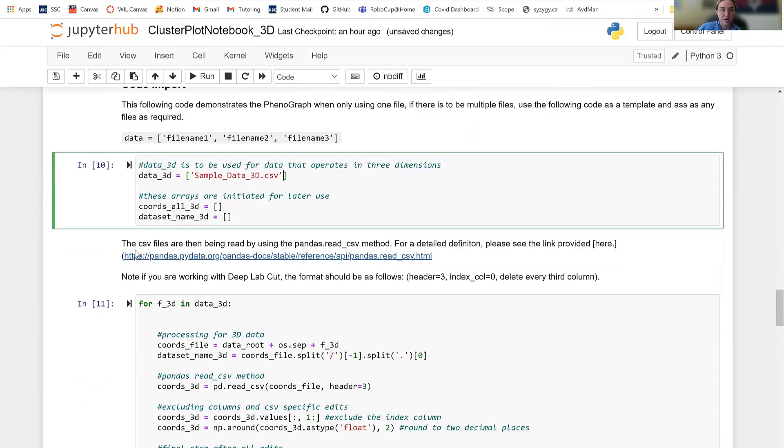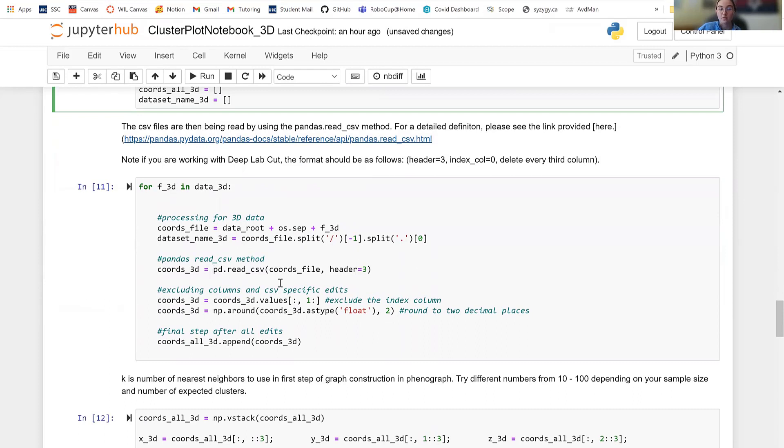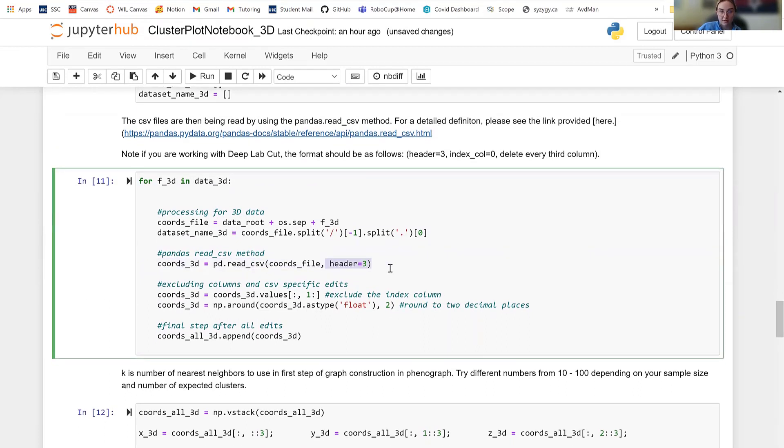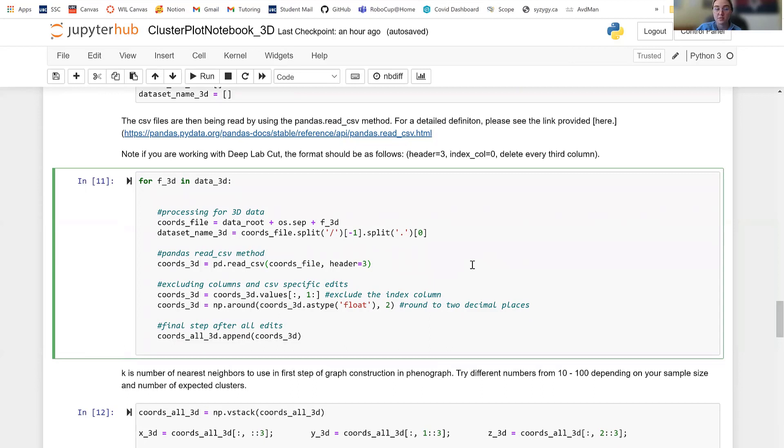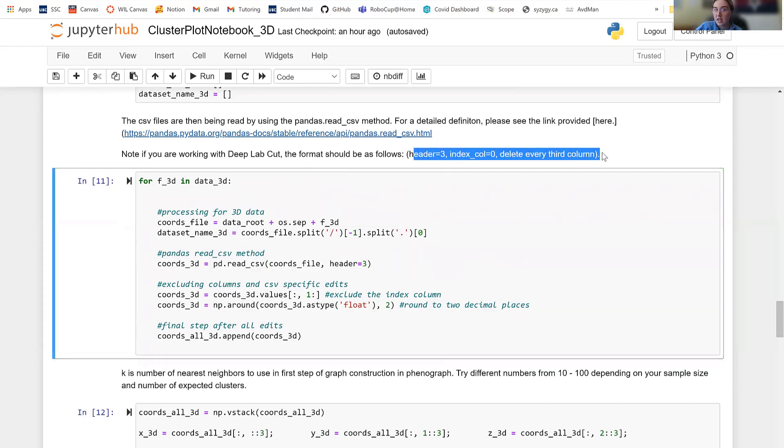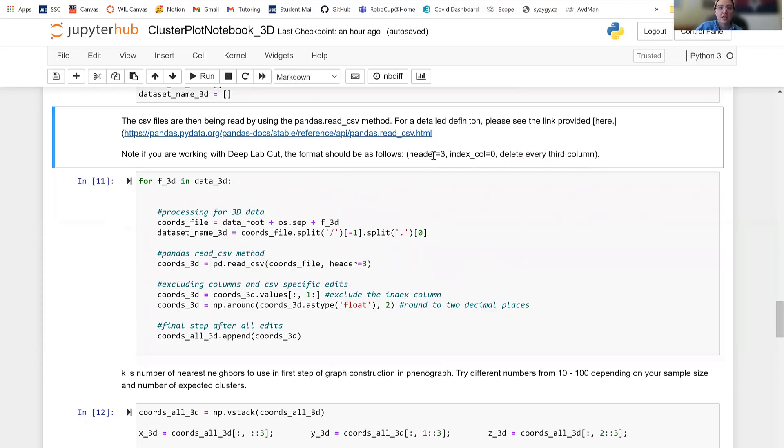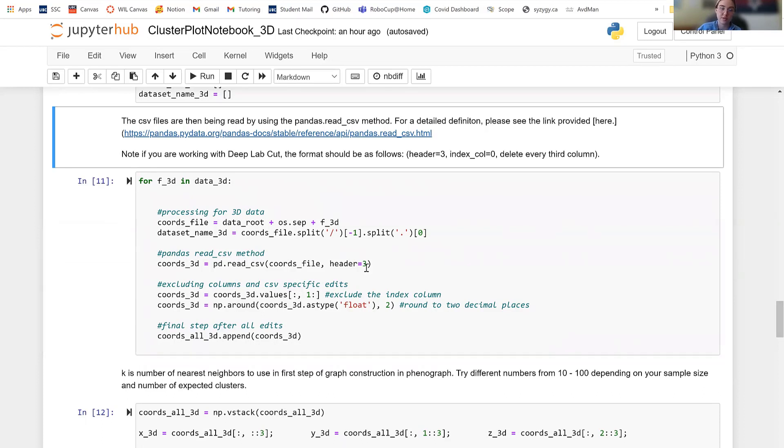So after you run that, I'm going to go down here. And this is where you would put in header. So for my example, I use header equals three, because that's where my data starts. And this is a for loop that is going to run for the amount of times that you have for the amount of times or the length of your array. So I only have length one. So it's only going to run once. But if you had multiple different files within that array, it would run that amount of times. This is the typical setup for deep lab cut. And the index column is equal zero.